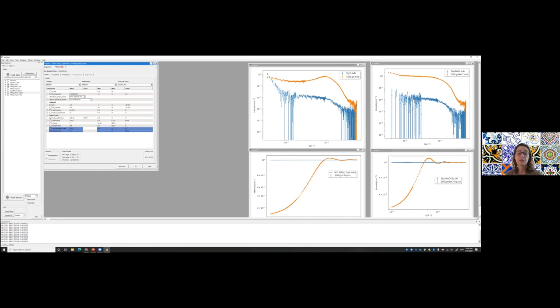But yeah, you can absolutely use models from other data. It will, I'm not gonna lie, get more and more complicated as the structures become larger and larger. And if it gets too complicated, or if you don't have enough data, then you can use these kinds of simplifications, where you just use a more generic model, because you may not be interested in the structure per se, just in interactions, for example, like we're doing now. So yeah, it depends what you want to see, as always.